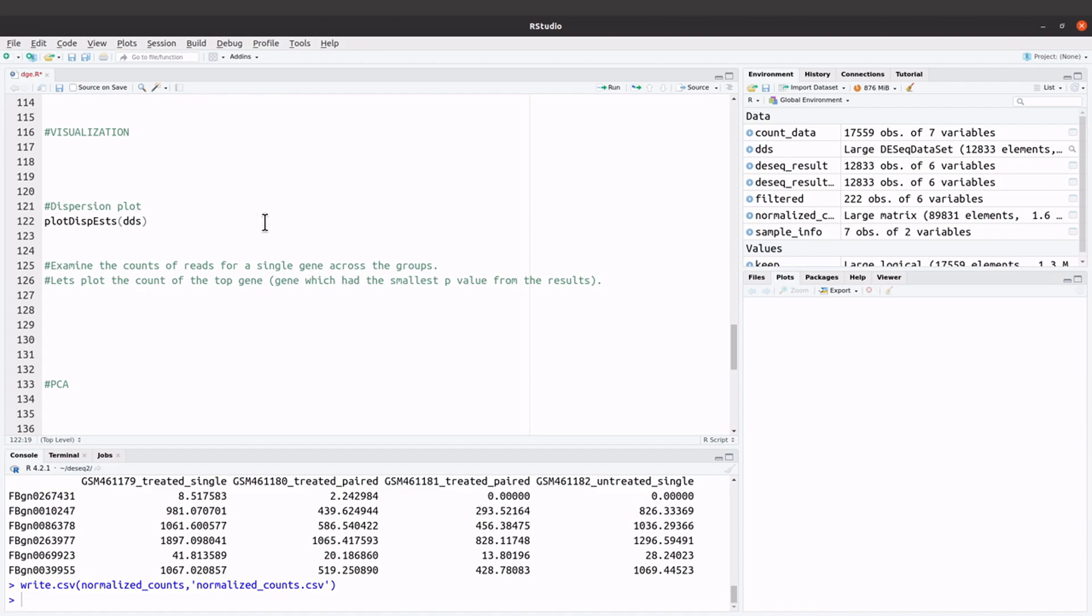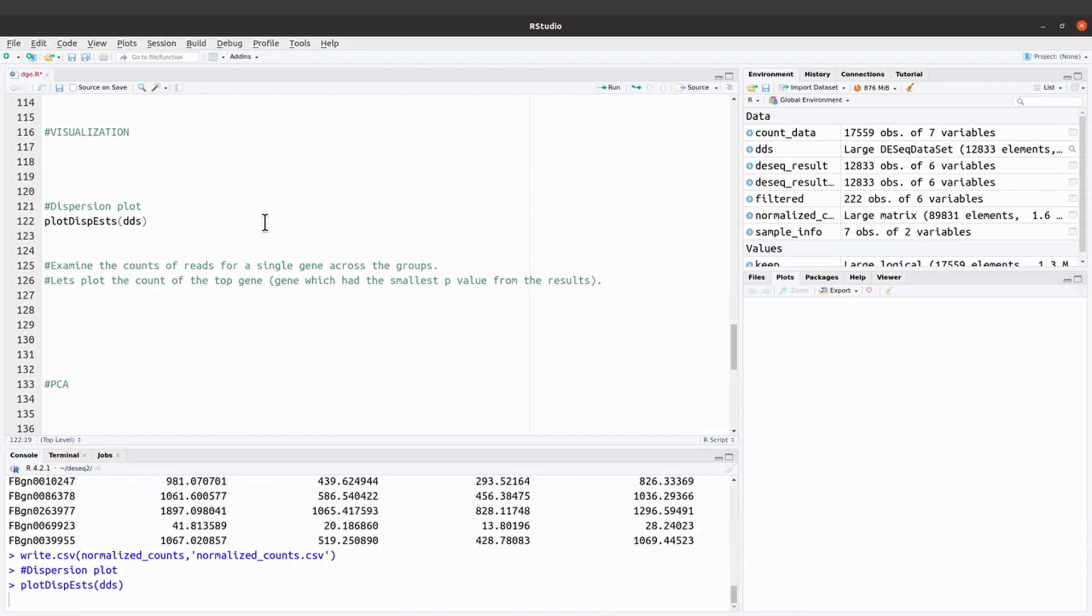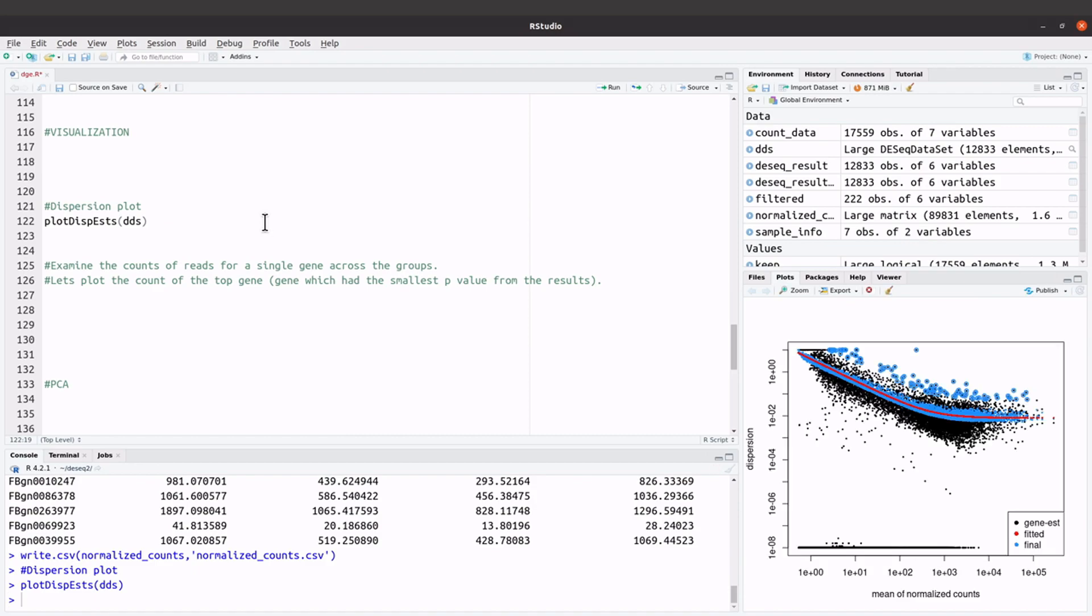Let's run this command. Our plot has been generated. A typical dispersion plot will look like this. Let's go to the DESeq documentation page.